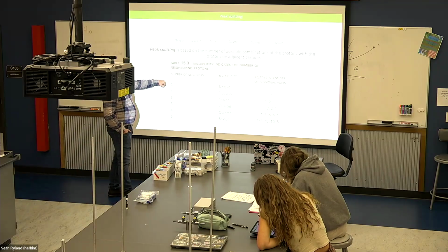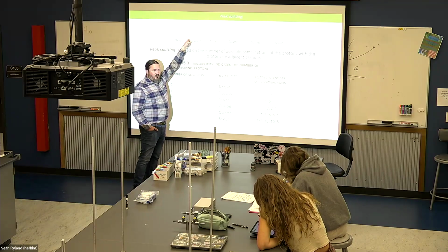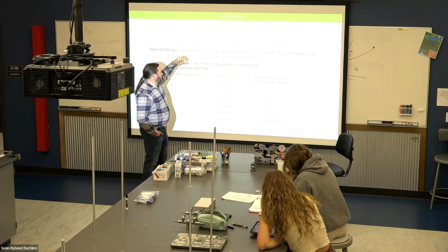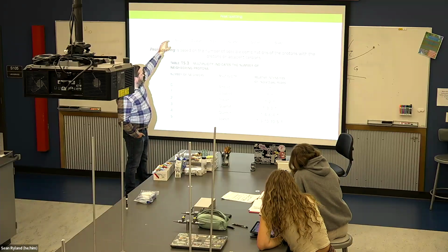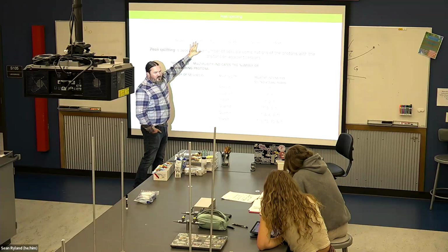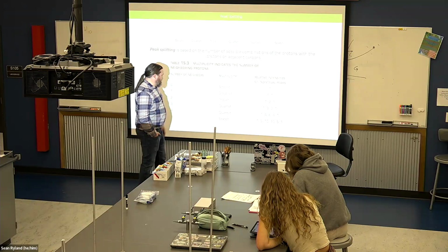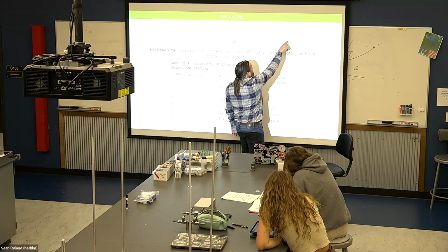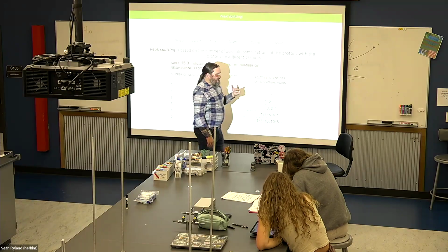If you have no nearest neighbors, there's no coupling with the hydrogens on the adjacent carbons, so you only see a singlet. If there's one nearest neighbor, you get a doublet. If there are 2 nearest neighbors, you get a triplet. And they're always going to have this sort of bell curve shape. It gets more obvious the more peaks you have.